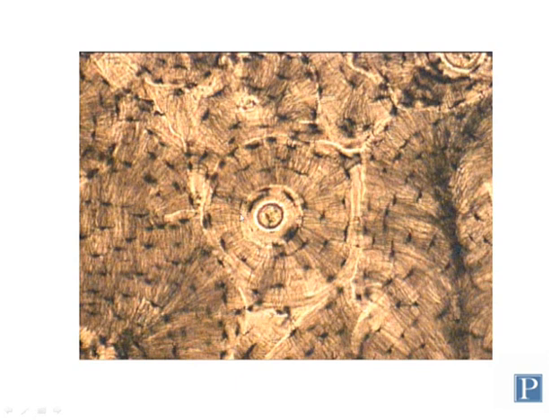So this is a concentric lamella on one side of this lacuna, and on the other side of this lacuna you have another concentric lamella. So the lacunae sit right between where adjacent concentric lamellae face each other.